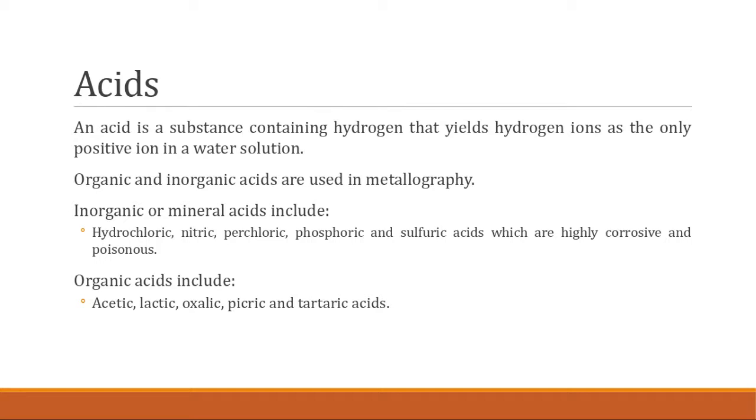Picric will not be used because UTEP does not have picric. I utilize picric here at the lab I work at. So the majority of the acids we're going to be using are inorganic.